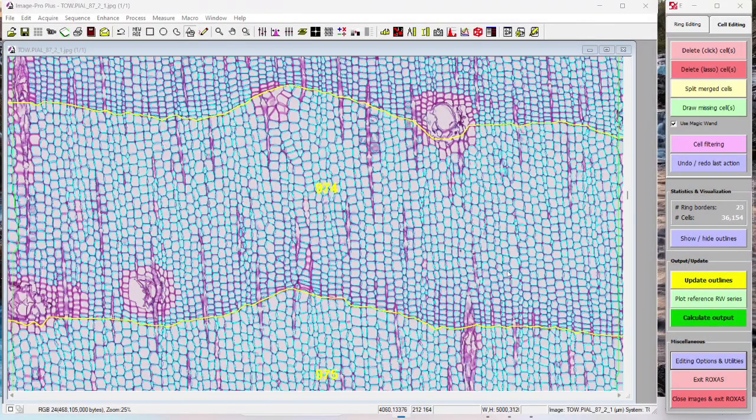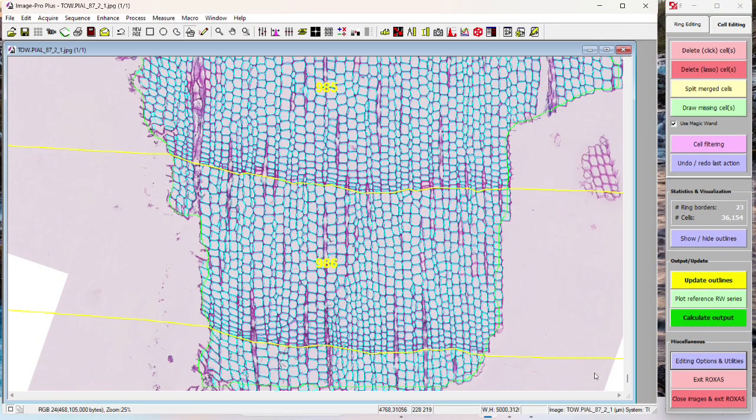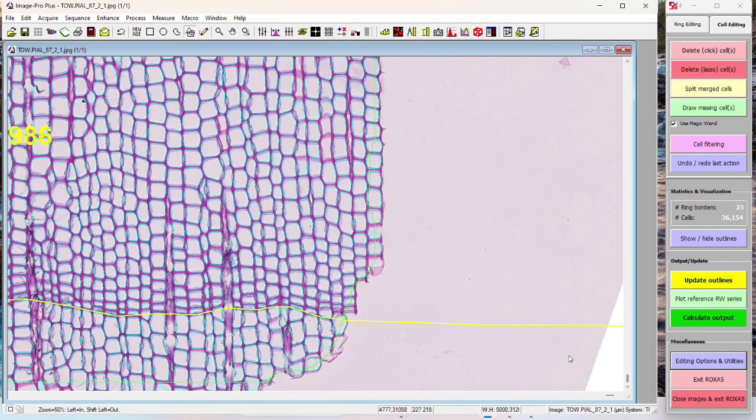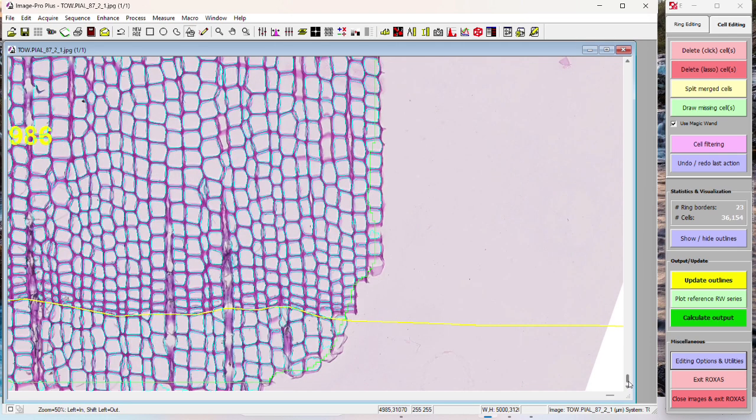And real quick, as I mentioned before, this image is much more complicated, with many more anomalies than your average image. Typically, you're just going to want to look at the rays, and I would recommend when you're doing that to start in a corner, like down here in this corner, and zoom in one or two clicks, maybe just one. Usually when you're doing all of the other tasks for an image, you already get an idea of how many incorrect selections there are for cells, and you might have seen one or two in the rays, you might have not seen any.